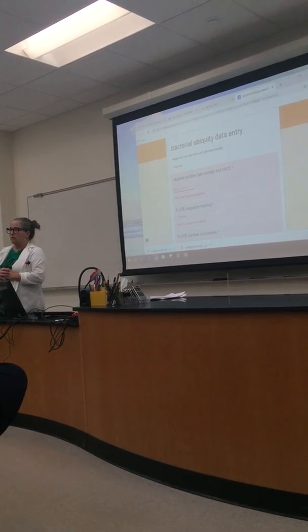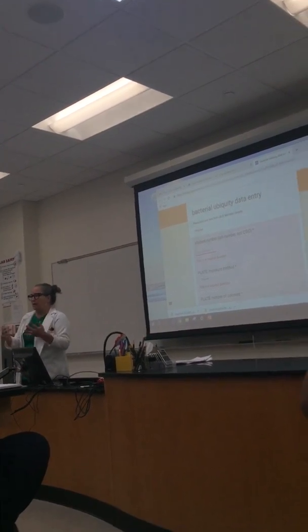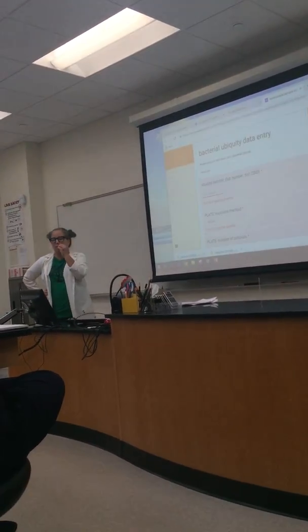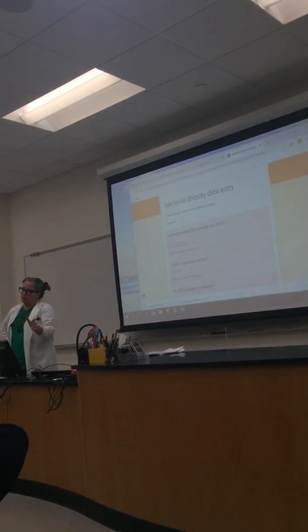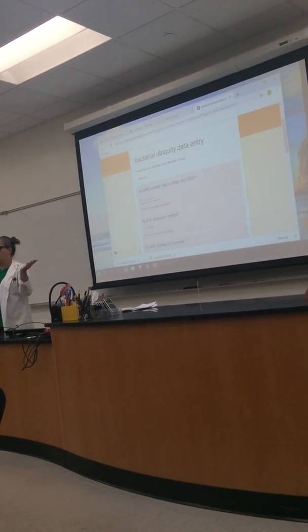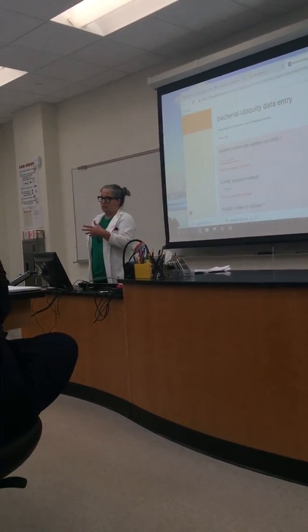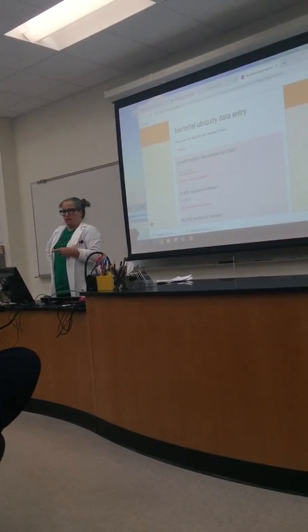And Amy. The lab manual says that if you have over 100, just put like 100 plus. So should we just put 100? Yeah, you can put 100 plus. That's fine. It'll allow you to put something that's not technically a number, I believe. I'll make sure. If not, I can fix it. I'll check it when we take a break today. But yeah, you can put 100. Or if it won't, you can just put like 1,000, and we'll know that meant you weren't able to count them. Because one thing you'll be learning soon in class is that we never count more than 300 colonies on a plate. So whenever you see more than 300, it just means there were so many, we don't know how many there were.